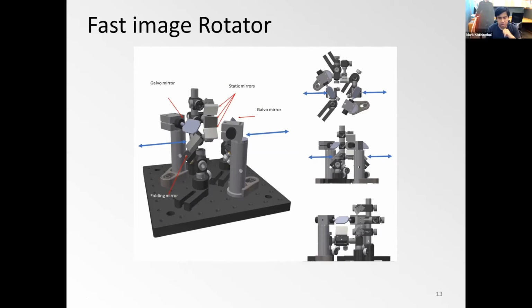So, each of the structured illumination patterns are then also at an oblique angle, though, right? They're not quite in plane, or do I misunderstand that?